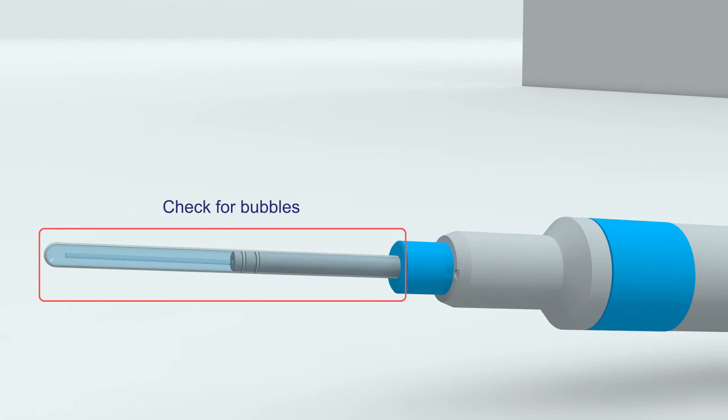Check that there are no bubbles in the glass flow tube. Now we are ready to insert the flow tube assembly.